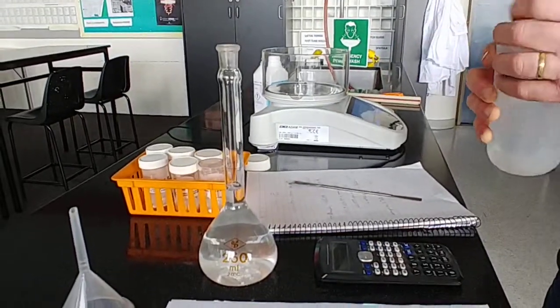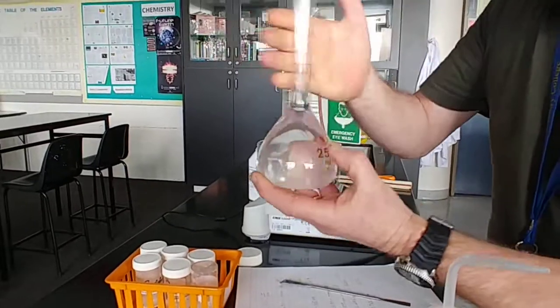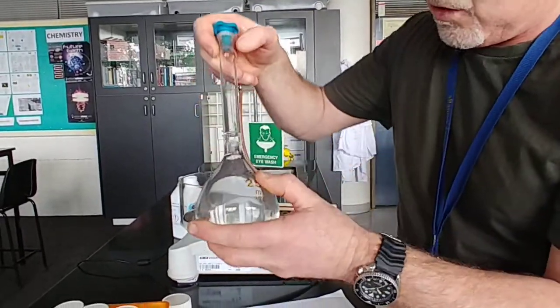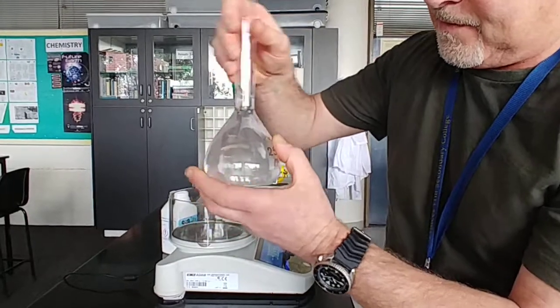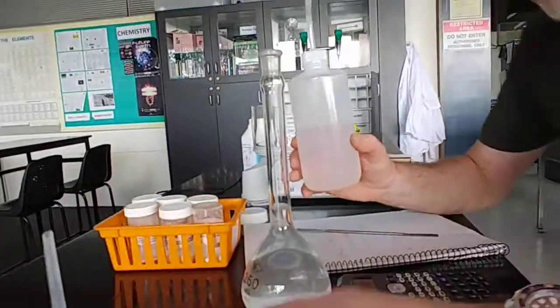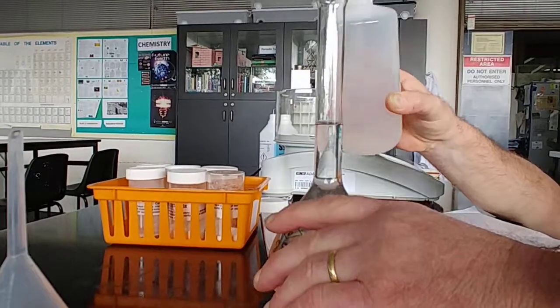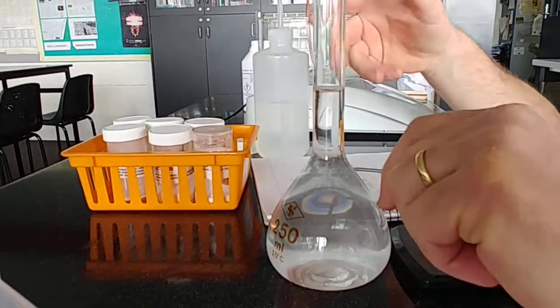Okay, just let it sit there for a while, get all those bubbles out. Persistent bubbles there. Gone. Oop, not quite. Okay, that's not too bad. There we go. Now what we need to do now is come down to eye level and gently bring that right up and not to go over the limit. The bottom of the meniscus has to be in line with the mark. Now all these air bubbles in here are taking up space, so what will happen is if you let this rest, that level there will drop a fraction and then you come back and top it up to the line.